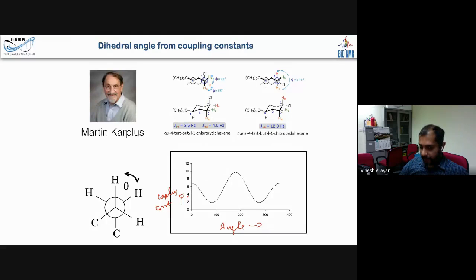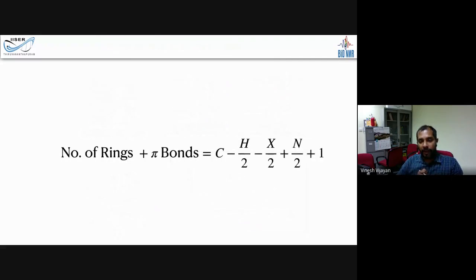All right. So this is a very important aspect in biomolecules also. So we determine dihedral angles, we find chemical shifts and coupling constants, and then determine dihedral angles of your peptide backbone. And that should be able to distinguish between alpha helix, beta sheets, and things like that. They have different dihedral angles. Now, if you want to do NMR determining structure of molecules, what is important is to do this.